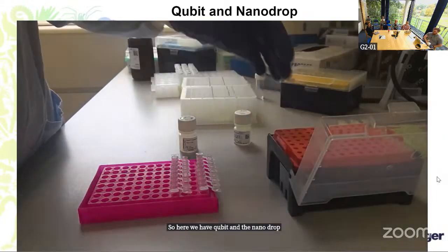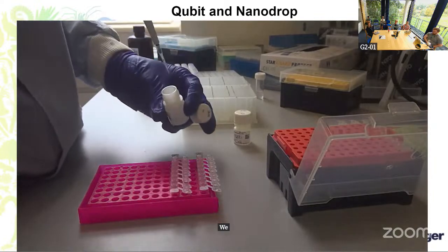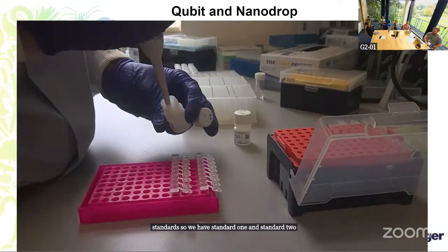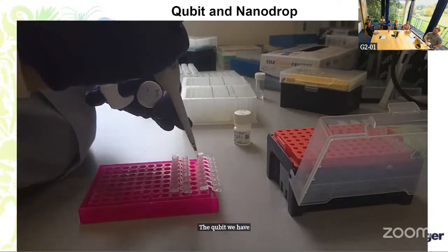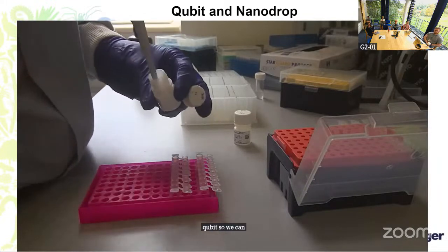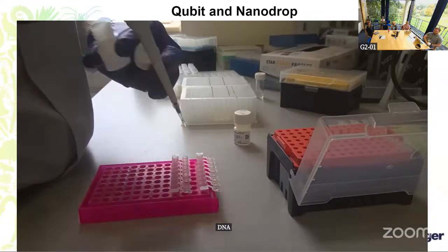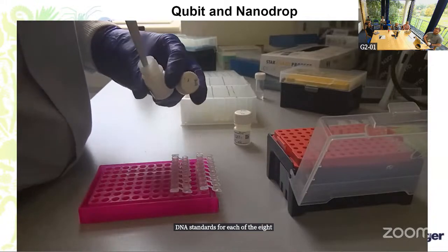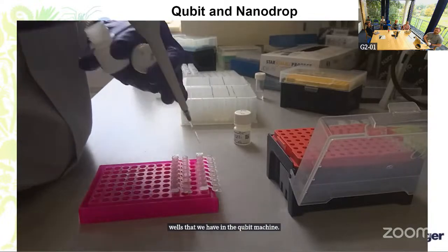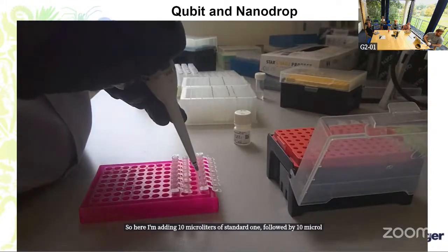So firstly, starting off with the Qubit, we add in our standards. So we have standard 1 and standard 2. The Qubit we have in the lab is a strip Qubit, so we can do 8 samples at a time. And that means we have to put in DNA standards for each of the 8 wells in the Qubit machine. So here I'm adding 10 microliters of standard 1, followed by 10 microliters of standard 2.